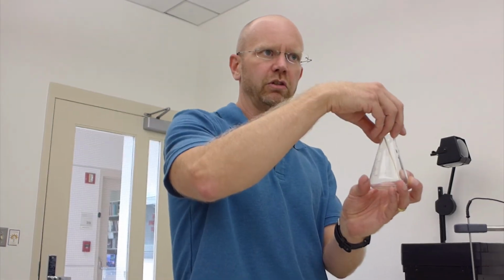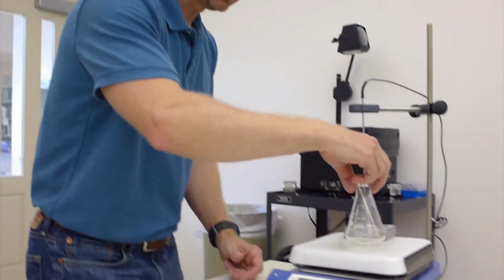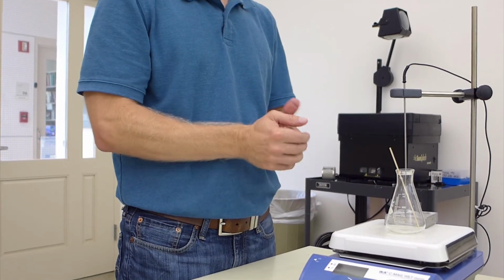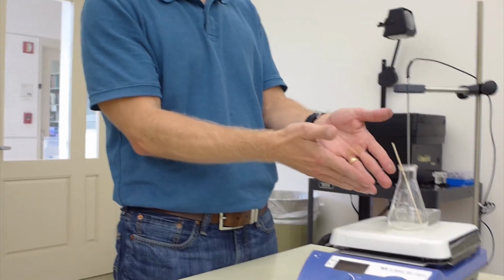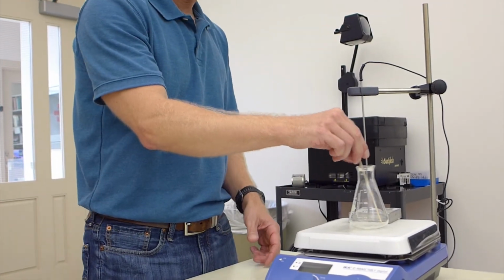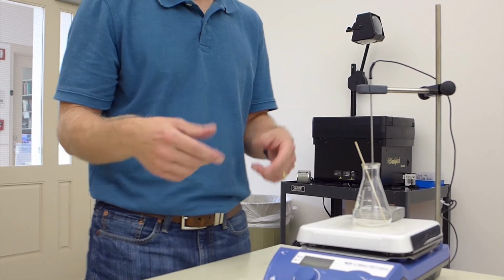So the first thing you do is you get pure solvent, that perfect solvent you picked, and you put it on the hot plate and you set it at a temperature that solvent will boil. So let's imagine we have that solvent now gently boiling, and this stick is causing the bubbles to nucleate, so you get a gentle boil.